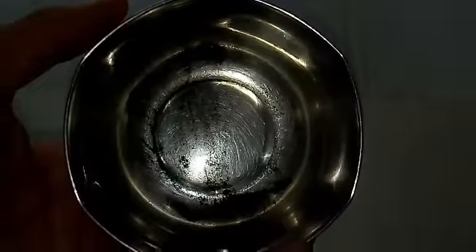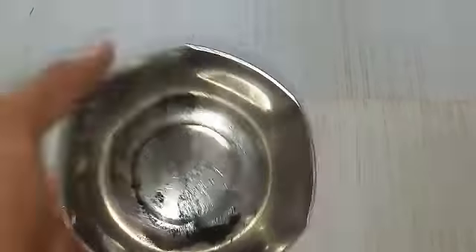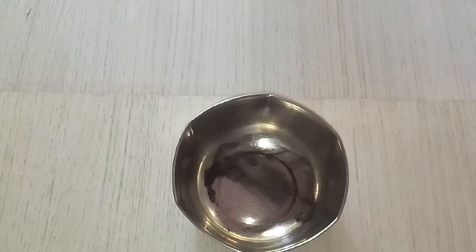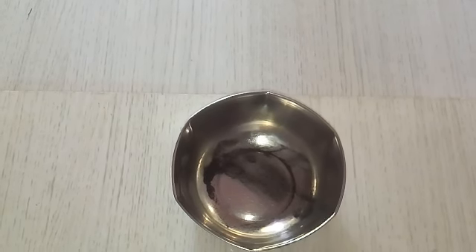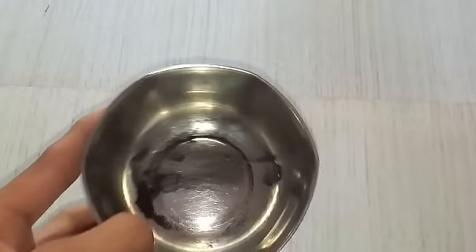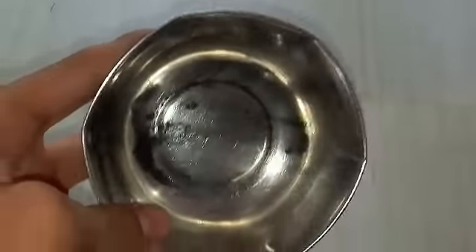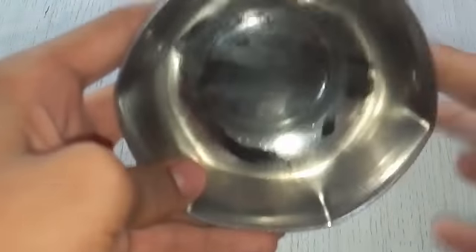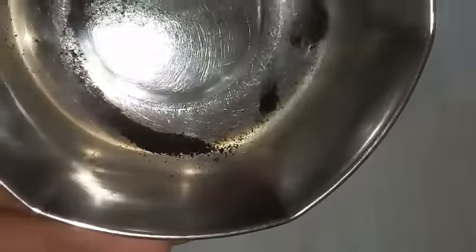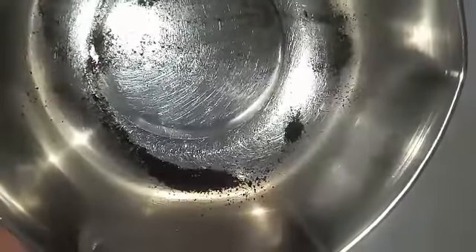I'm sorry about that, but what I did is I took the carbon and washed it 2 to 3 times with distilled water, and then 2 to 3 times with acetone to get as much as organic as well as inorganic impurities from it. So this is the cup. I have scraped off all the carbon from it, and this is this much of the carbon powder I'm able to get it. It's much pure. It shows the purity of about 95%, which is very high as compared to a homemade stuff, and you can see that it's much better.